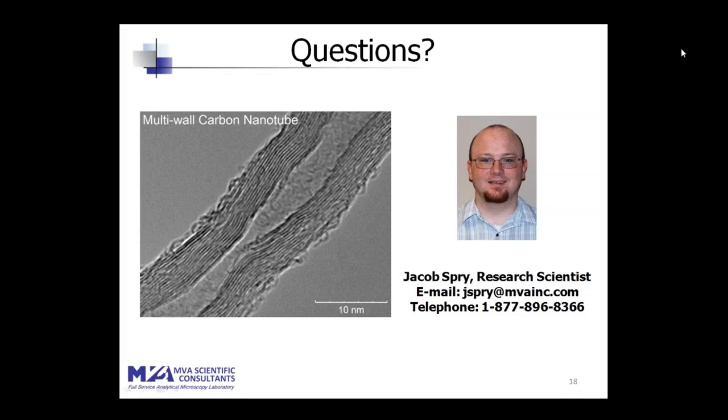Have you done any work on carbon fiber or carbon nanotubes? I can address this one real quick. Yes, we have imaged and acquired a variety of materials, spanning from carbon fiber, carbon nanotubes, nano diamond, nano silver, all sorts of nanomaterials.